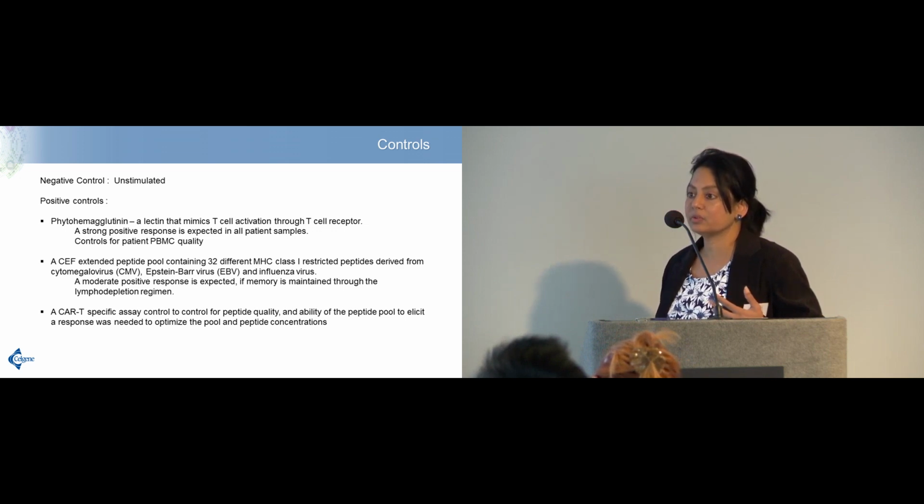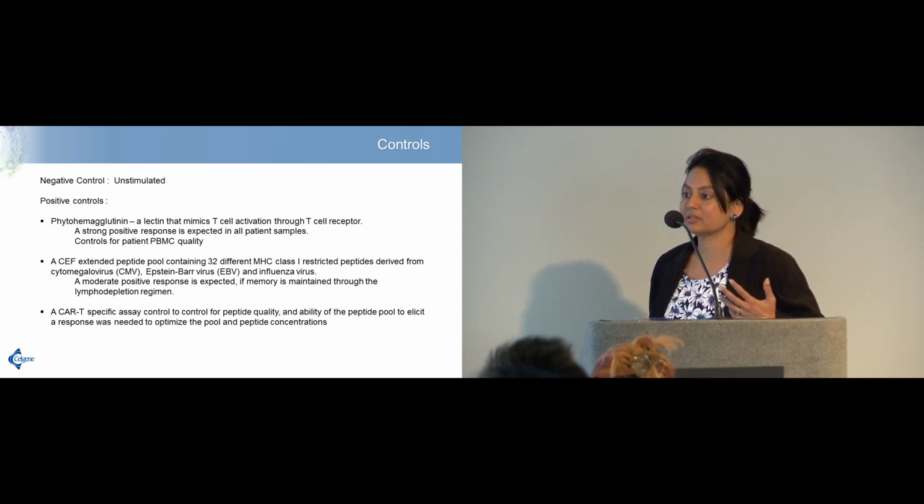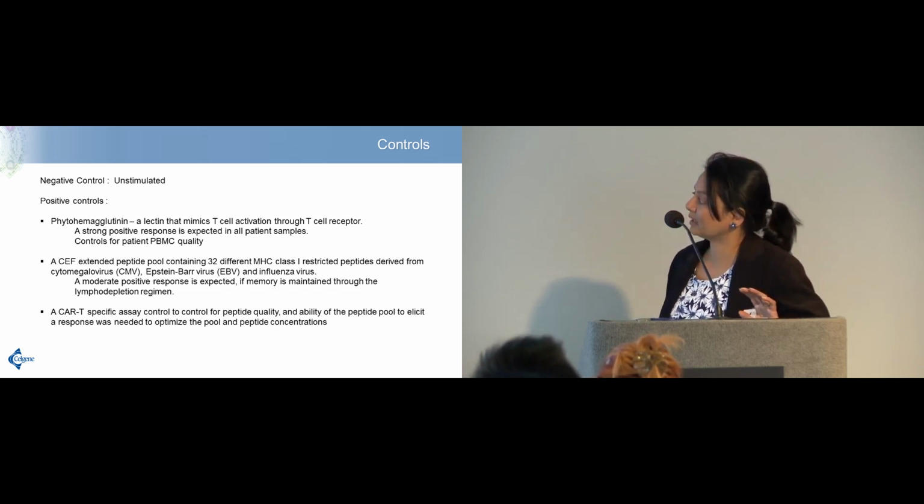They have memory response, and so when you add this peptide pool, they should produce interferon gamma. So the question was, in our lymphodepleting regimen, what do we deplete? And how robust is this memory response in these patients? So it was a little bit of an extra question that we hope to answer if we could with this CEF control.